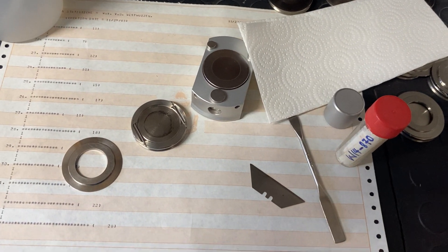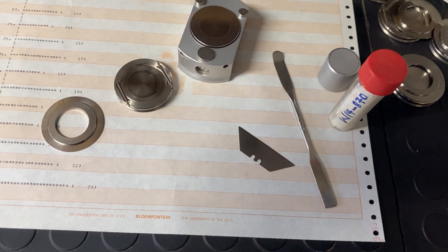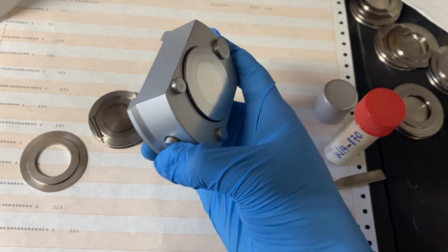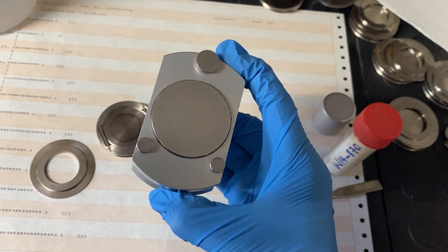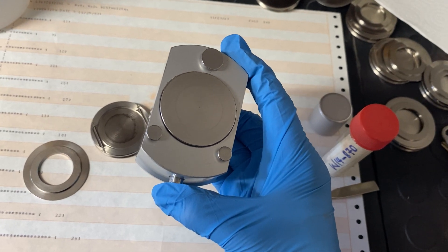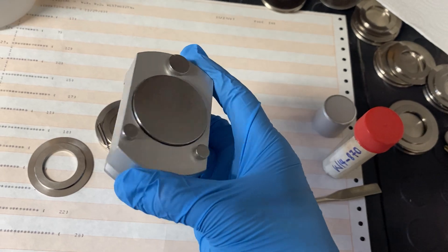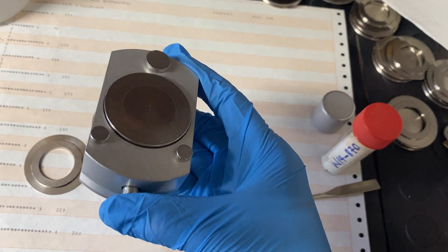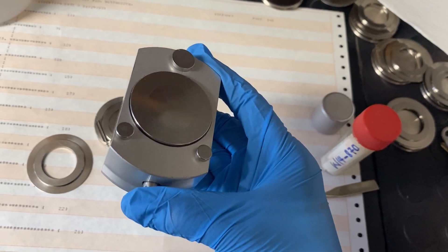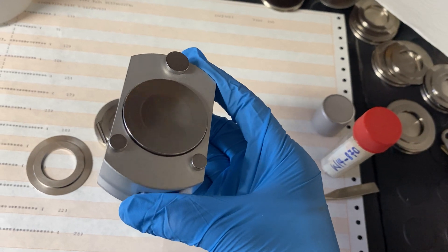When you prepare the XRD samples, you begin by examining the sample holder. You will notice a button, which you can press to move the piece inside. This piece is crucial as it allows the top part of the sample holder to either lock it in place or be released when necessary.